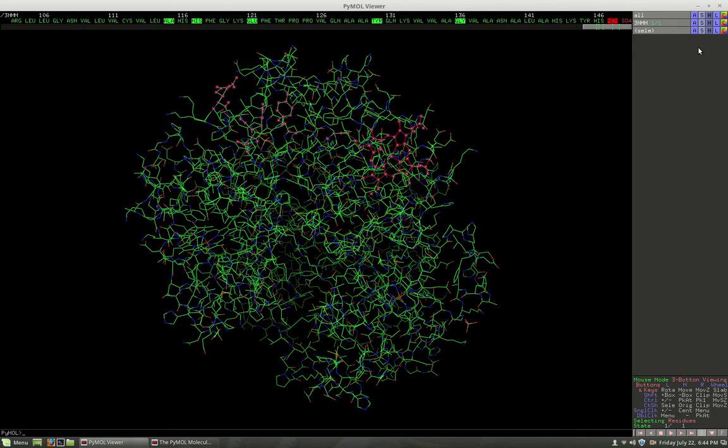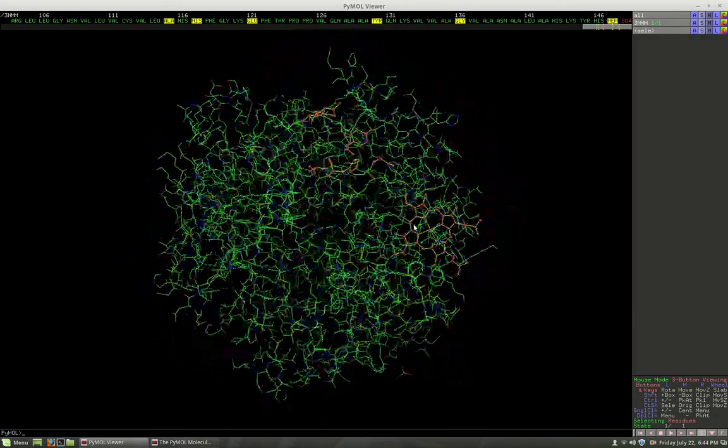Alright, and if I wanted to change those to a different color, I could come over here and choose those. Let's say I'm going to make those yellow. We can choose a particular type of yellow. Just use regular yellow. And so those are now yellow.